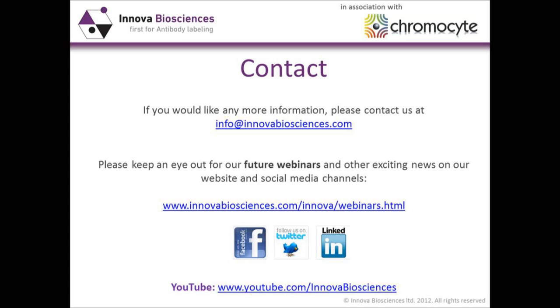Okay, so there's also been a question. I mentioned during my section of the talk about being able to measure fluorescent intensity, and that gives you some indication as to how bright an antigen is expressed. And we've been asked whether it's possible to quantitate that brightness and so put an actual figure on it. And yes, this is possible to do. There are a number of commercially available beads which have a defined number of binding sites on them, and so you can calibrate your instrument and actually work out how many antigens are on the surface of your target cell of interest. So yes, this is possible.